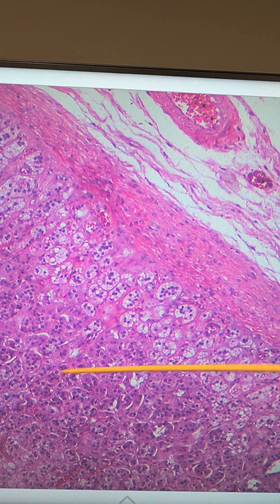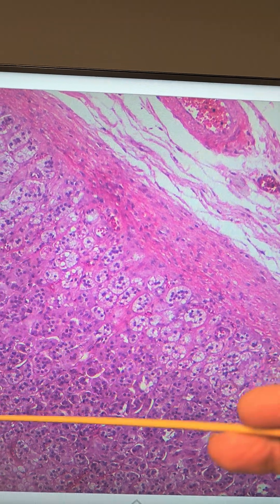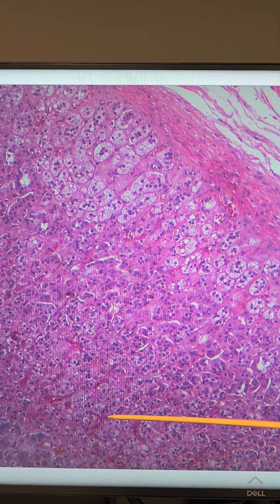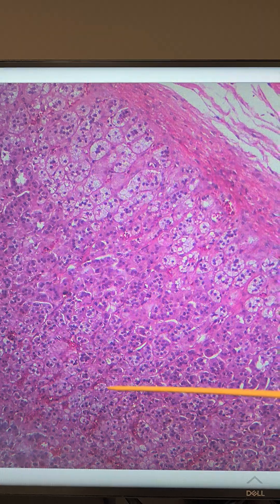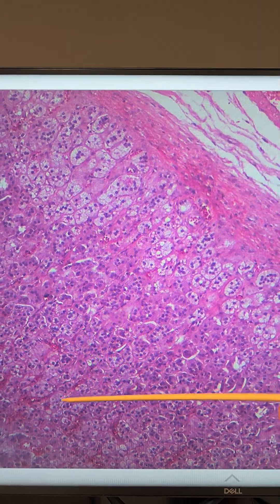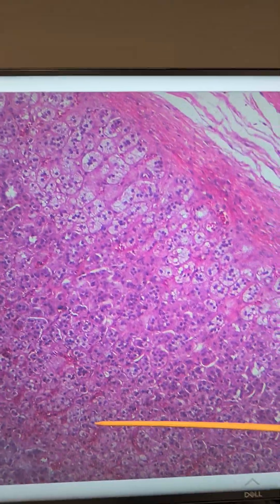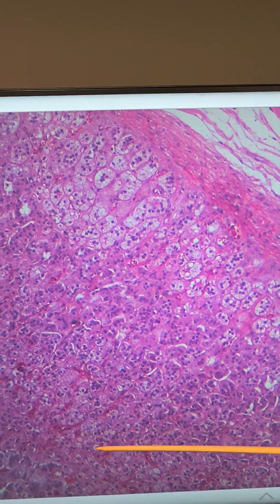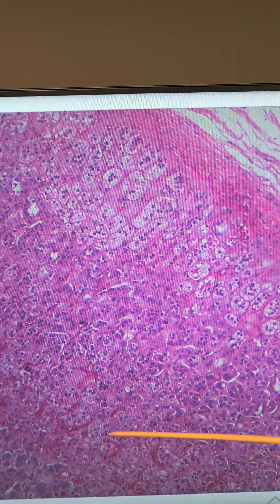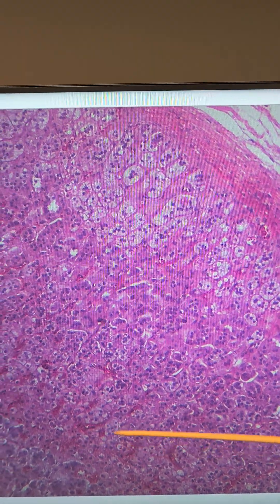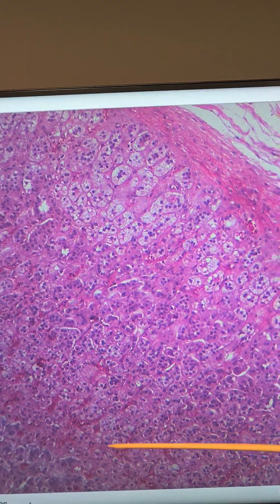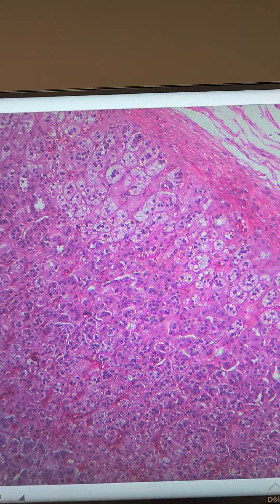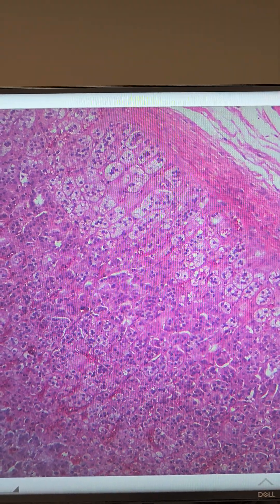Here's the zona fasciculata. And then the deepest layer is the zona reticularis. The zona reticularis has cells that produce gonadocorticoids known as androgens, which can be converted into estrogens and testosterone.